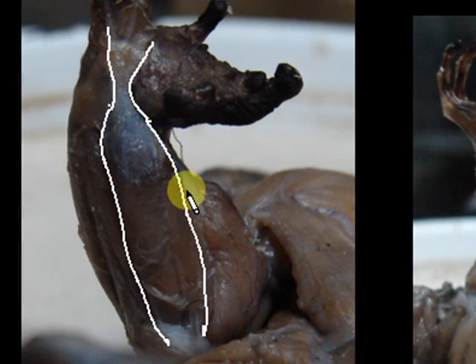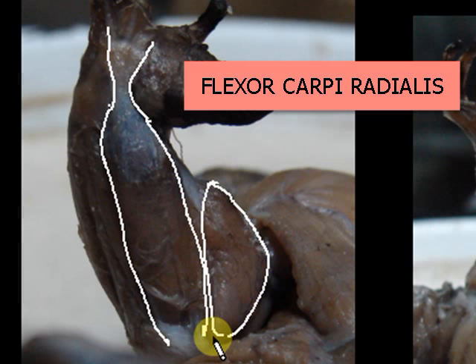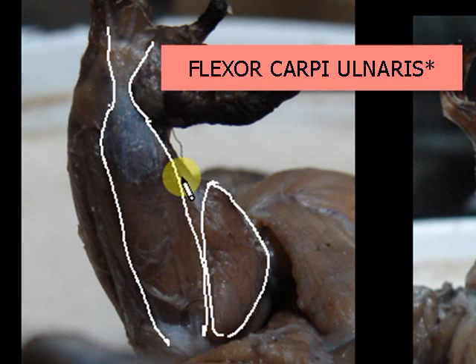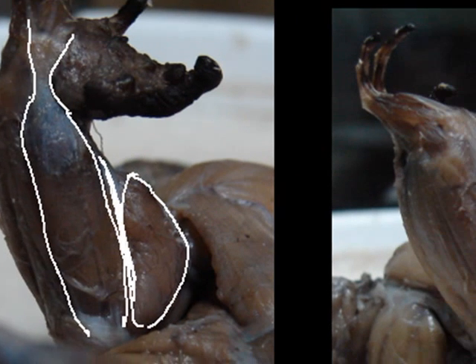The palmaris longus will be your point of reference. Right next to it you will see a big fat triangular muscle — that would be your flexor carpi radialis. The flexor carpi ulnaris is partially hidden by these two in this view, so we will look at a different view later.